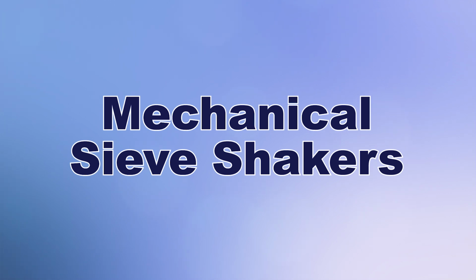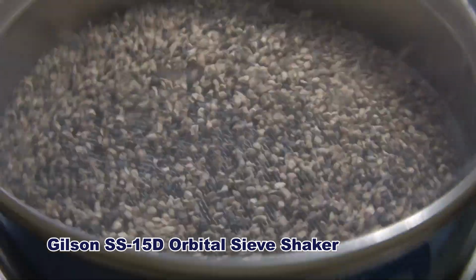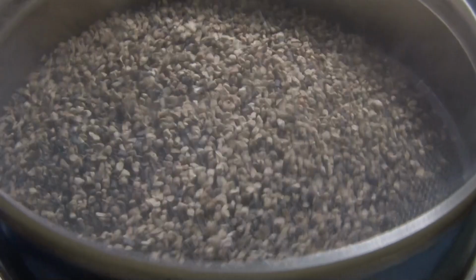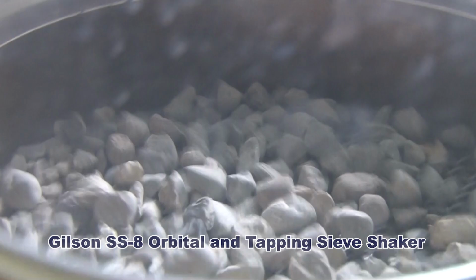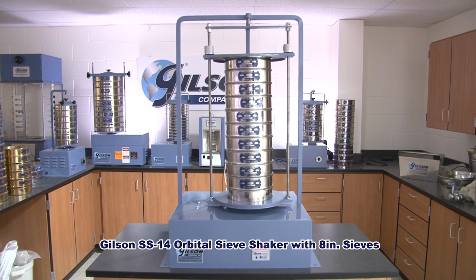Mechanical sieve shakers have a motor-driven mechanism to agitate and reorient particles with orbital, circular, or rotational motions. Some mechanical shakers also use repetitive tapping to the sieve stack to enhance passage of particles and prevent the blinding of mesh openings by near-sized sample particles.